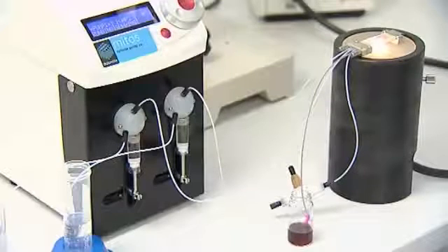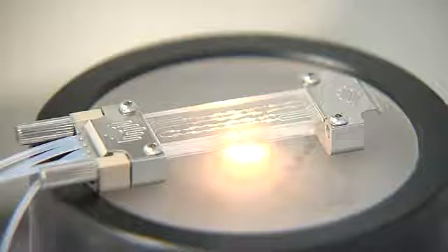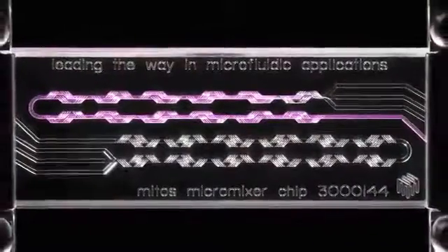Another important role for microfluidics is rapid and consistent mixing. Here two components are mixed within a few milliseconds.